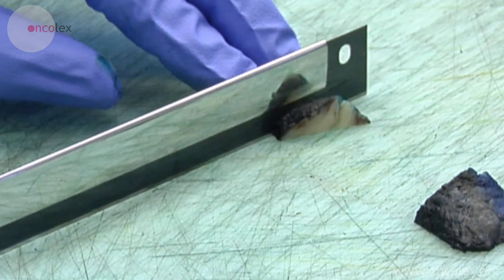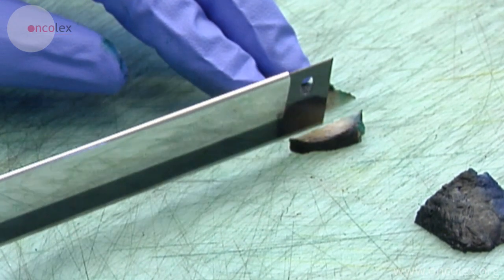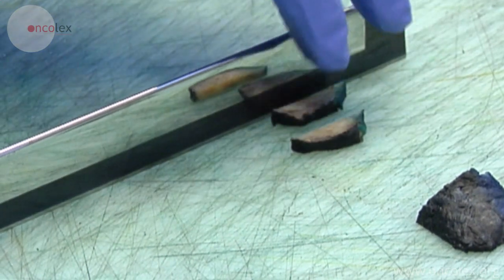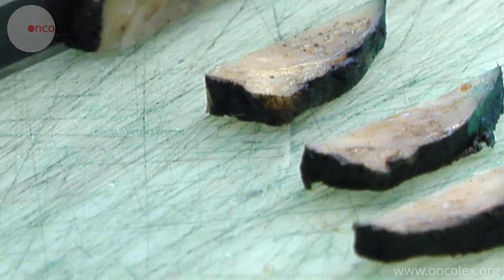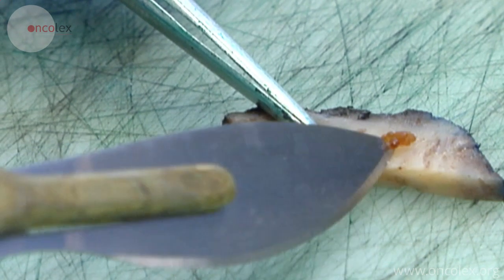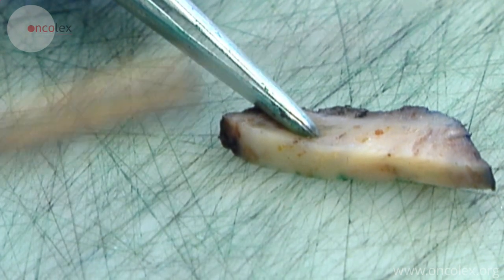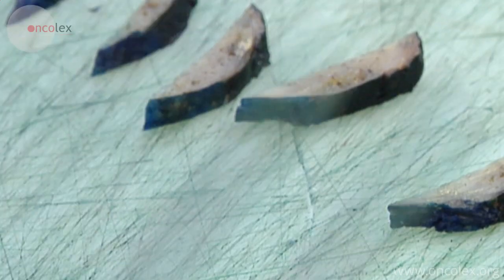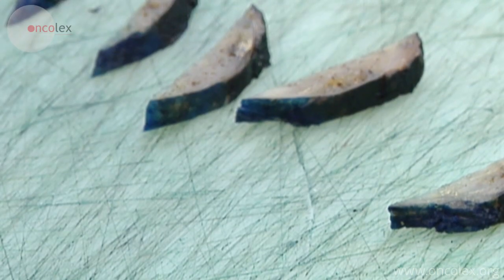Both halves of the apex are cut in sagittal slices, from the central to the lateral part. Any calcium stones in the slices are removed. Each slice is placed in its own labeled container.